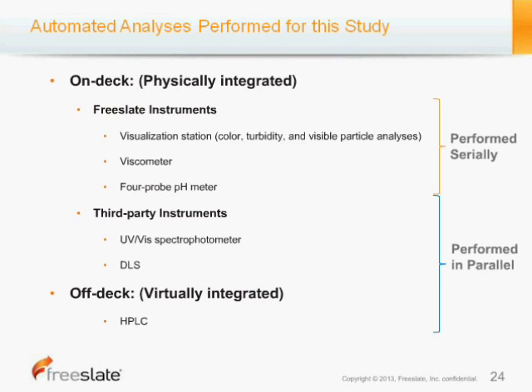Okay, so as far as our automated analyses go, here I'm splitting it up between our on-deck, which we call our physically integrated analytics, and then our off-deck, which are what we call our virtually integrated analytics.